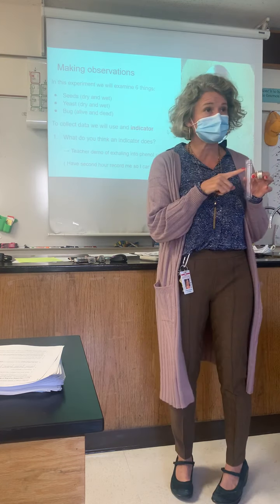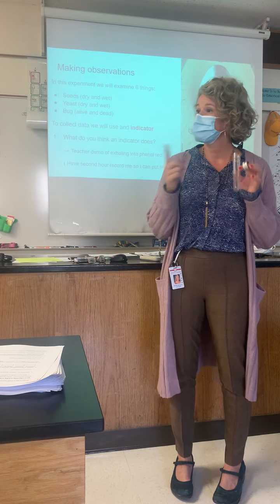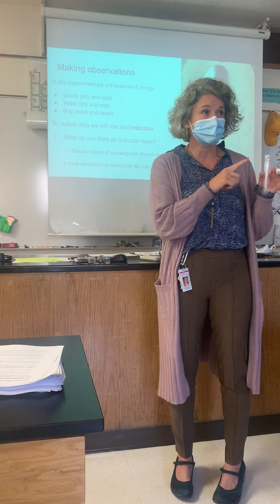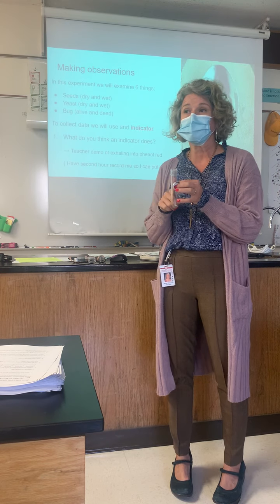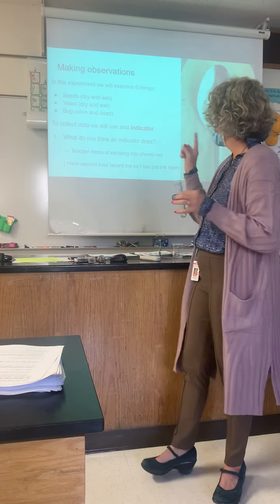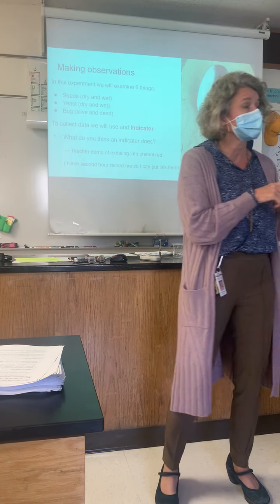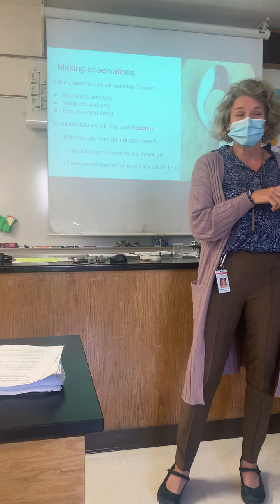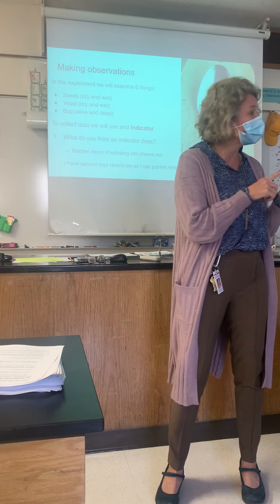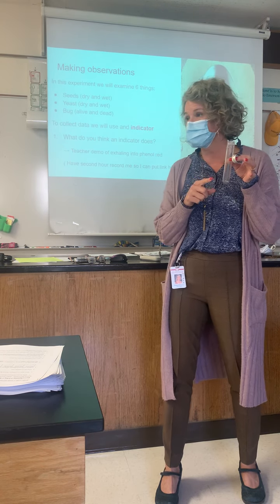Either seeds, that seed will either be dry or wet, one or the other. So one test tube with a wet seed, one different test tube with a dry seed, one test tube with some wet yeast, and one test tube with some dry yeast. One test tube with a live bug, and one test tube with a dead bug. But other than that, all the setups will be the same.